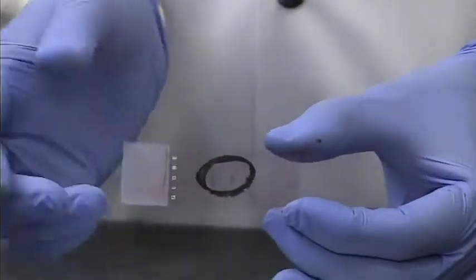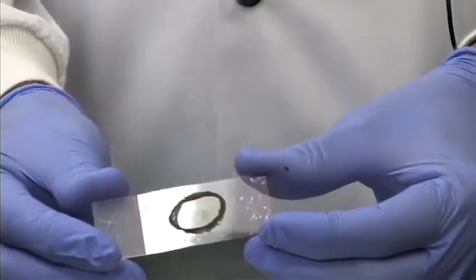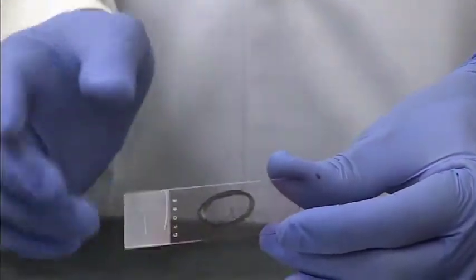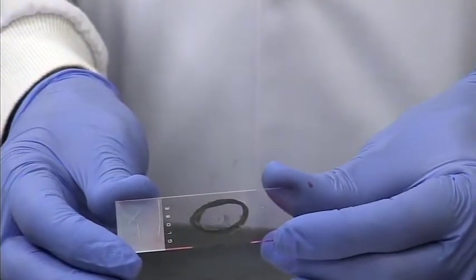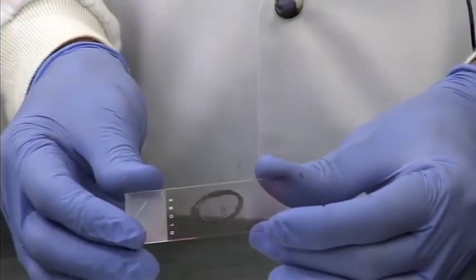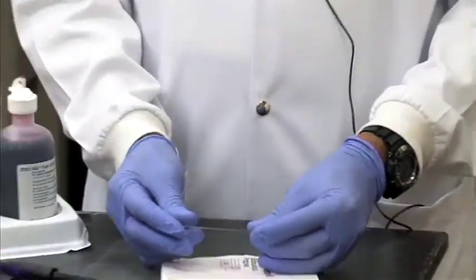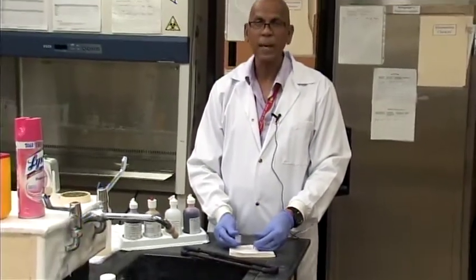It must be completely dried before you go to examine it under the microscope, because under the microscope, you need to apply a drop of oil and use the oil immersion lens to visualize your cells. All right? And we all know oil and water do not mix. So if you have water or moisture here, it's going to affect the quality of viewing under the microscope. So this is the end of the gram stain procedure. The next stage will be how to examine it under the microscope.